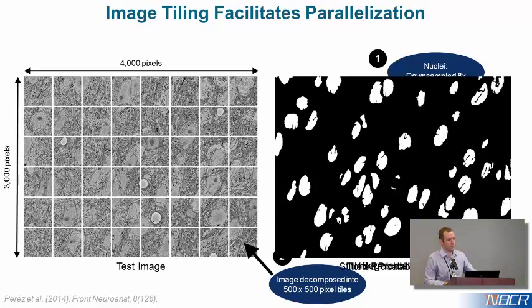So after you get these stacks of segmented images, you can apply a lot of morphological filters. For example, if you know a nucleus has a certain range of acceptable volumes or acceptable sphericalness, you can filter out the things that don't meet those criteria. For example, if you look at this final segmentation over here, there are some artifacts like these, which are probably not nuclei. Actually, I think this one is. I think that's one of the capillary endothelial cells.